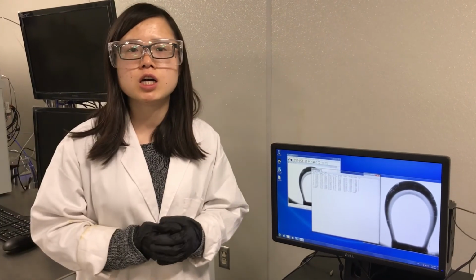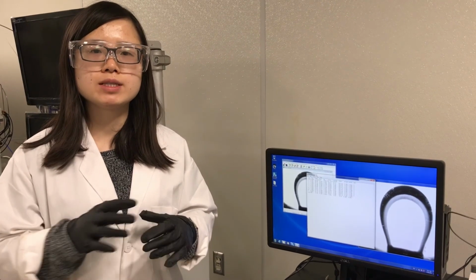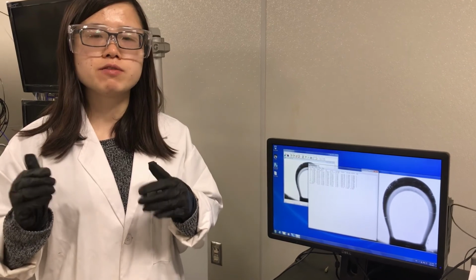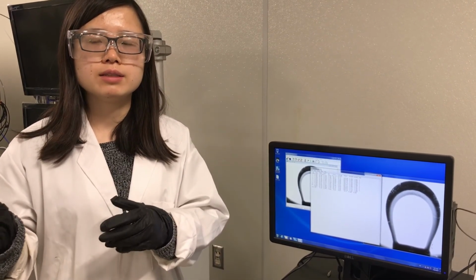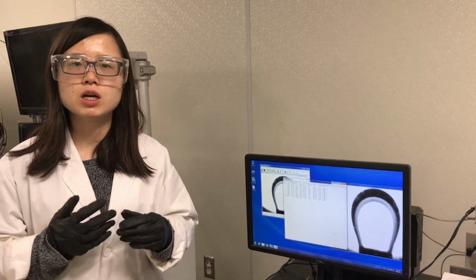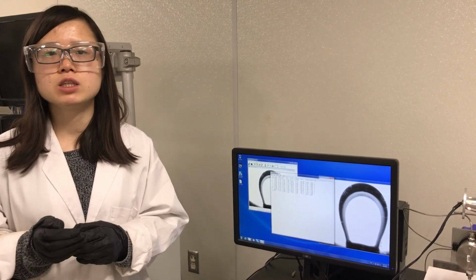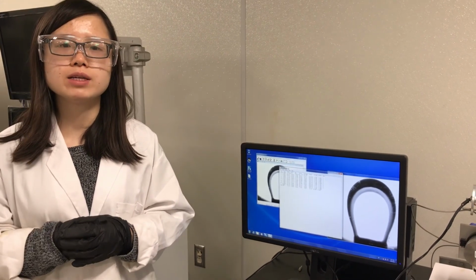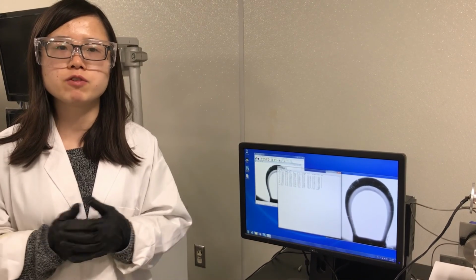And for the task you need to do, I have provided you with a series of data using different surfactant concentrations and the Bakken oil. What I want you to do is determine the critical micelle concentration of the surfactant. And the details of how to derive the CMC value, I have provided in the task file, and you can check that for further information.